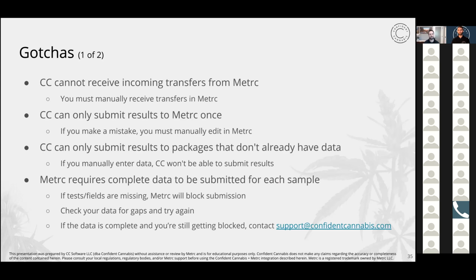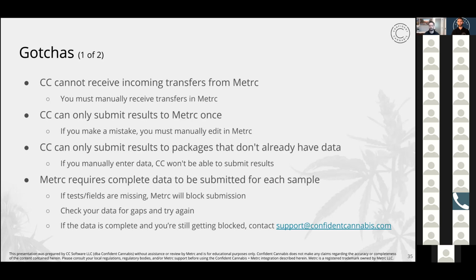So Confident Cannabis cannot receive incoming transfers from Metrc. We can do a lot of stuff with Metrc, but we can't receive incoming transfers. And that's by design. Metrc doesn't allow any third parties to do that. So you can do most everything you need to do in Metrc through Confident, but that's not to say that you'll never have to log into Metrc. You will have to log into Metrc to do certain things. And one of those things is receiving the transfers from your clients.